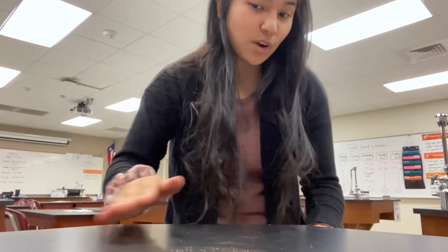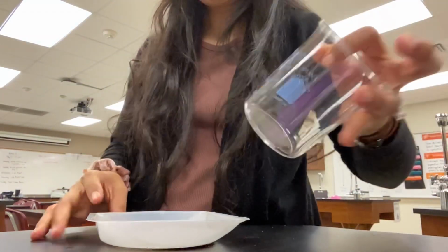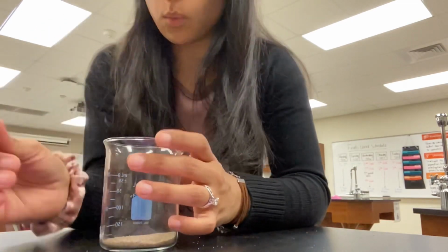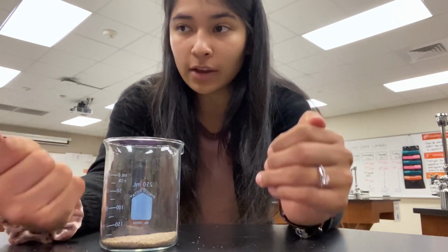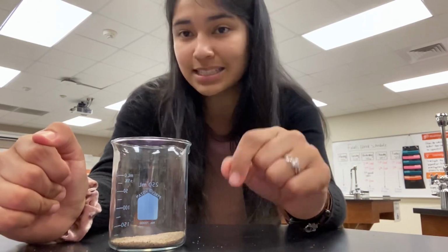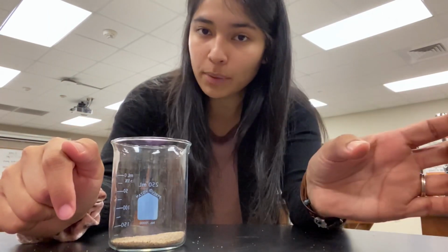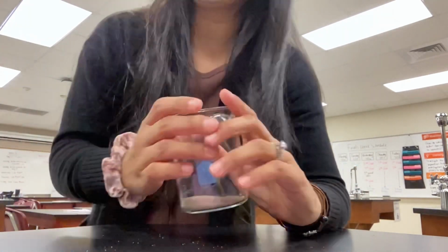So, like I said before, ionic compounds dissolve in water. So what I'm going to do is take our sample and place it in a beaker and add water. The reason I'm adding water is because I want to have all of my ionic compound dissolved. Then I'm going to use a filter. I'm going to filtrate it because the sand is not going to dissolve. The sand is going to stay as a solid. So as it goes through the filter, our dissolved ionic compound is going to go through with the water, but the sand is going to stay on the filter. So that's exactly what I'm going to do right now.